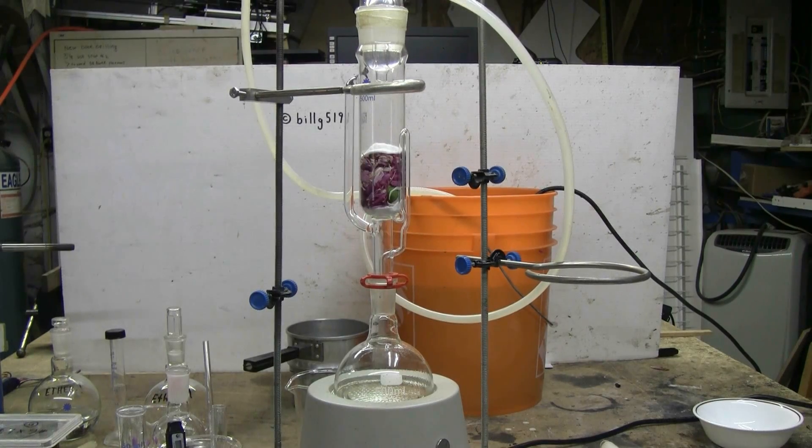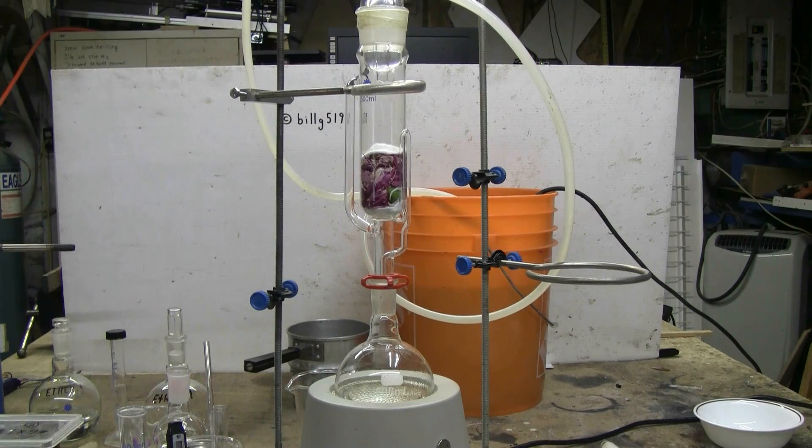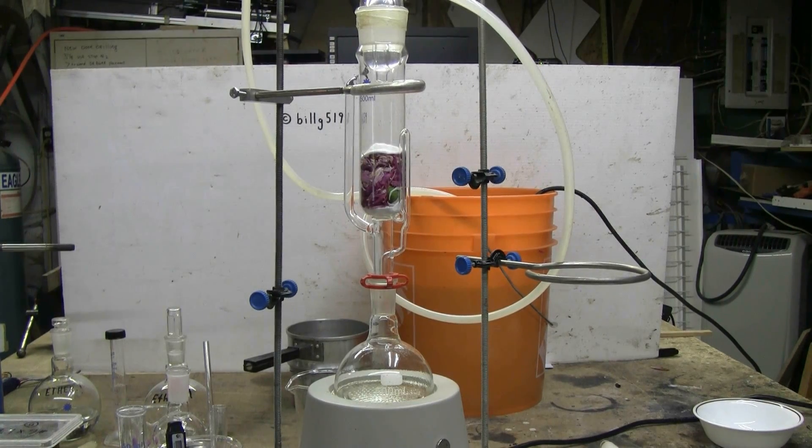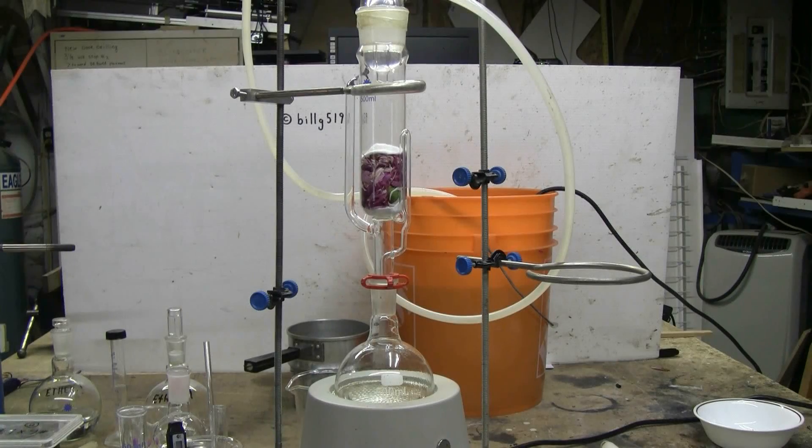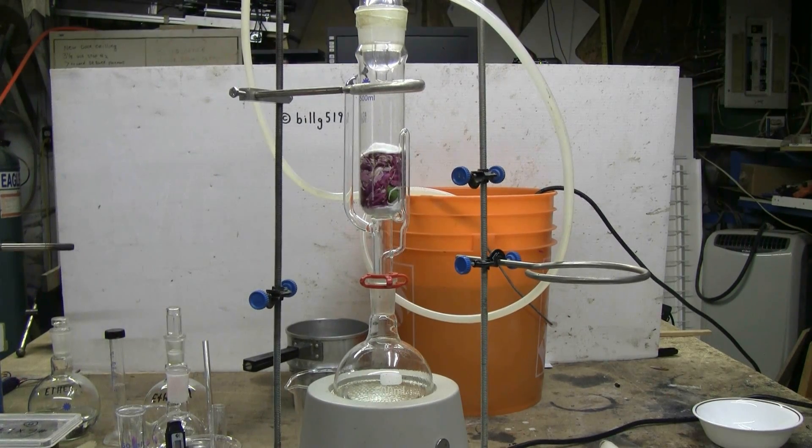I had more peony flowers left, so I've decided to do a second Soxhlet extraction to finish them off, but this time, instead of ether, I will be using ethyl alcohol, ethanol, as my solvent. So we'll give this a try and see what happens. The extraction with ether was colorless, but the extract did have the pleasant smell of the flowers. We'll see what happens with ethanol.